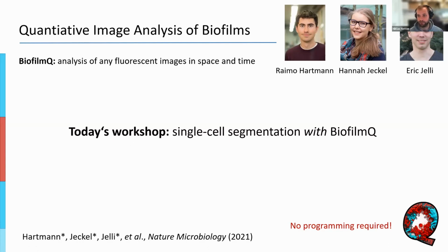So this should be hands-on for you. Please just speak up when you have questions or if something is unclear. And you can also follow up on what we will do later with your own data if you have that. Otherwise, it should be hands-on also if you don't have your data yet. And the second important thing is this is with BiofilmQ, which I will come to later. BiofilmQ does not do the segmentation, it's for analyzing, but we will talk about this later.